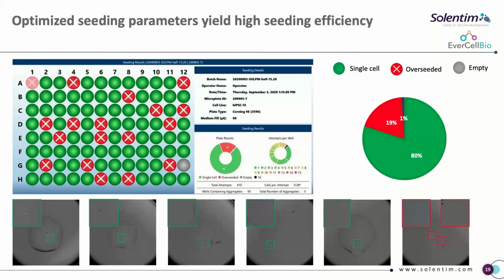And it's important to note that through all this optimization, we really feel that cell concentration is more or less set, and really all you're playing with is dependent on media. So even though I have gone through certain optimization procedures, I want to note that it's very seamless and very straightforward to do so during a run that you're about to perform.